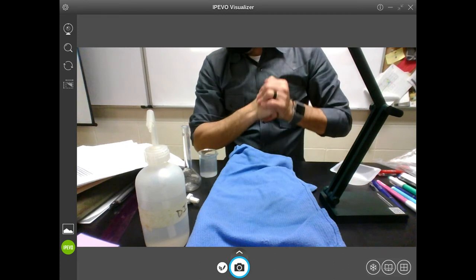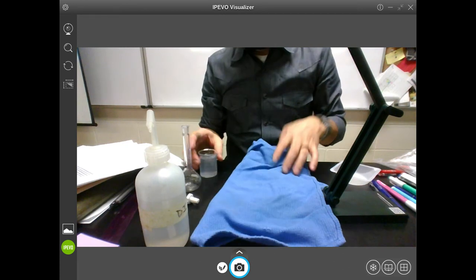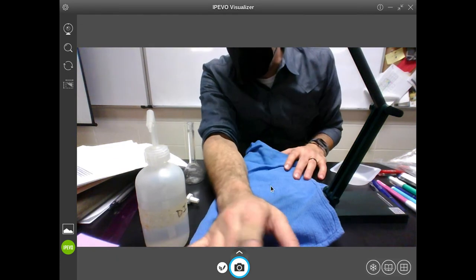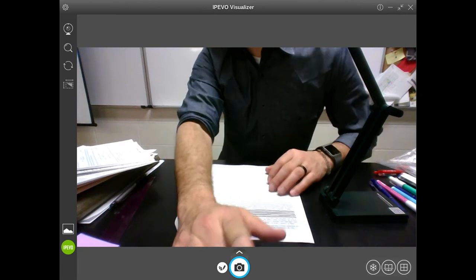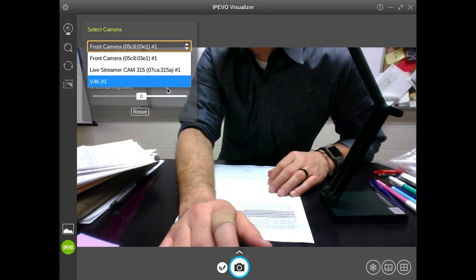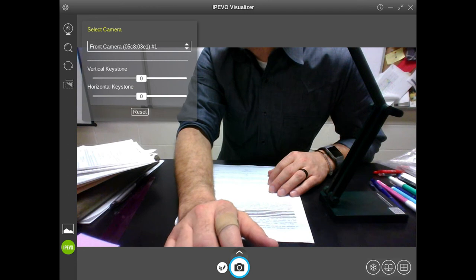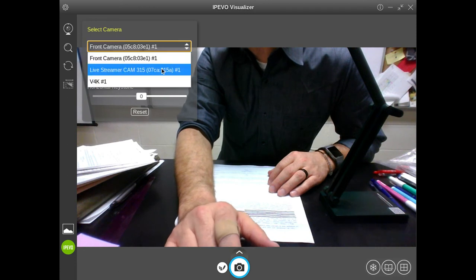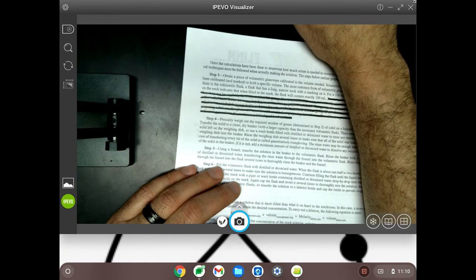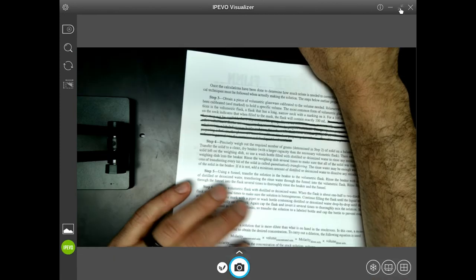Okay. All right. So let me switch this. Making the solution is the first step of what you're going to do. Did I not switch that? There we go. Okay.